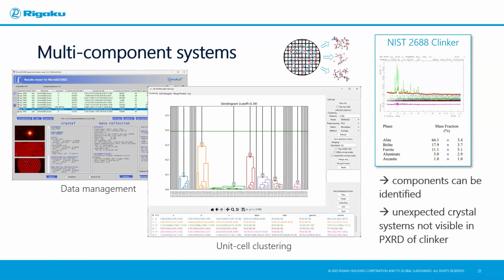at the moment, what I would recommend is quite simply to start different data collections at different starting angles and then merge them later on. That would usually be the way to go. What we do not implement is an online tracker, because that would yield quite suboptimal data as a whole. So we're not big fans of that approach. Thank you.